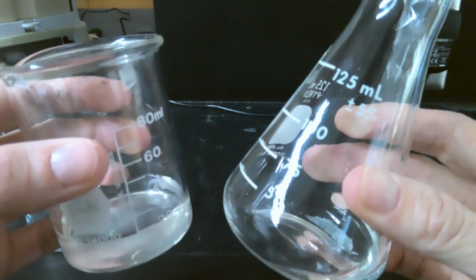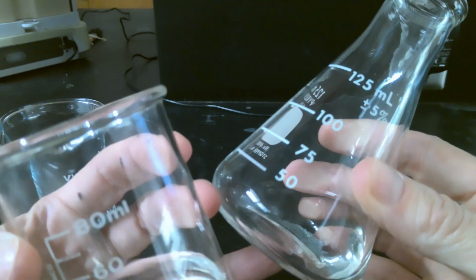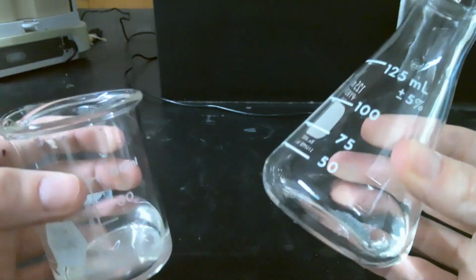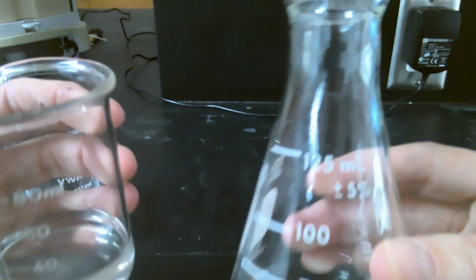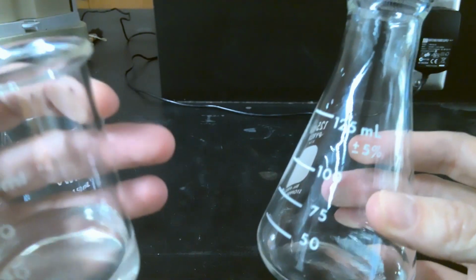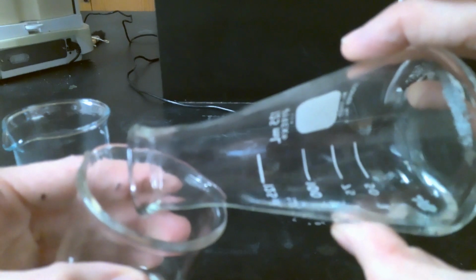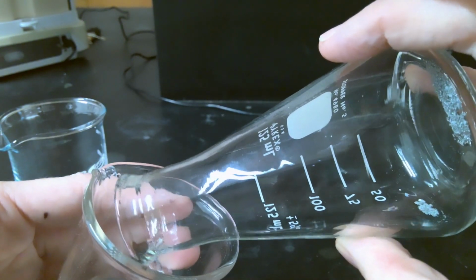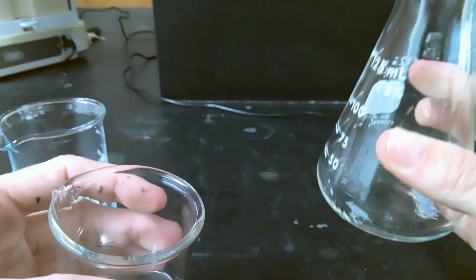In this case, it's a liquid layer, and we're trying to leave the solid behind. Sometimes you can decant a liquid off of a liquid layer, like you can imagine decanting a top layer of oil off of some water.